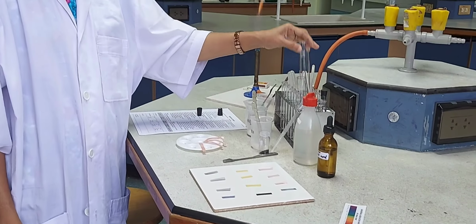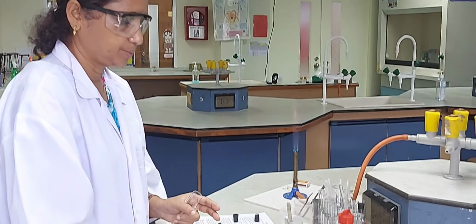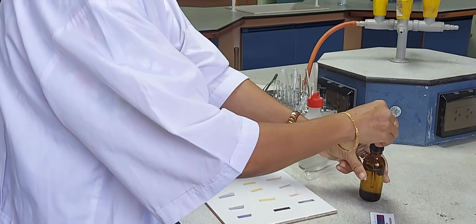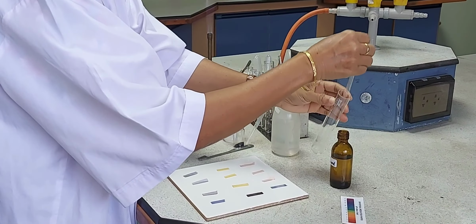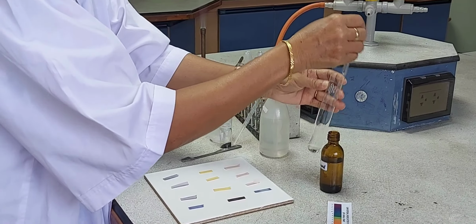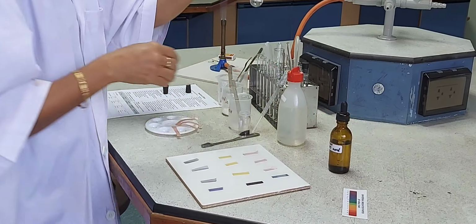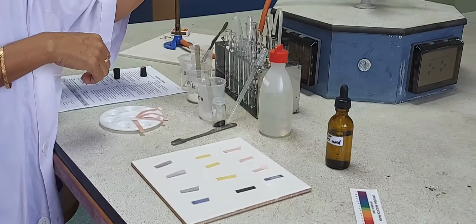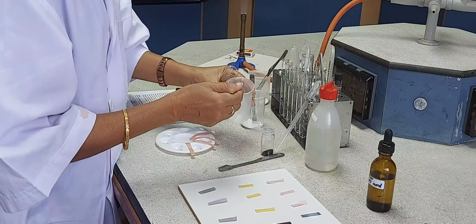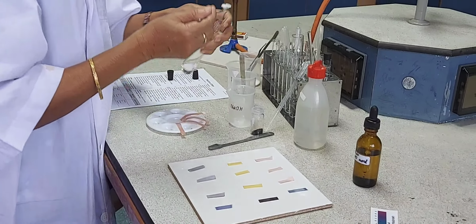The next, we will carry out a neutralization reaction by taking 2 mol per dm cube hydrochloric acid in a boiling tube. So, 2 cm cube of the dilute hydrochloric acid, and to this I am going to add a few pellets of sodium hydroxide and observe what happens.